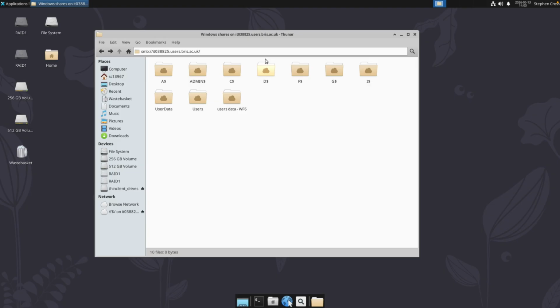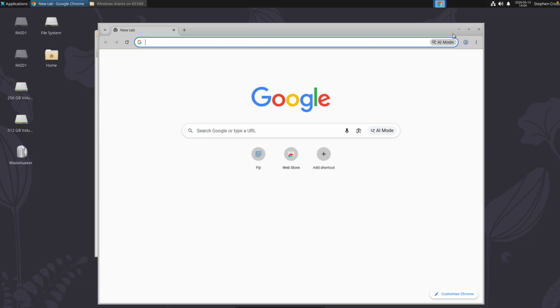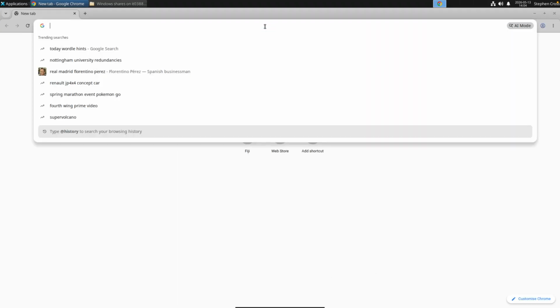As is standard, there is no OneDrive on the computers. That's not just a Linux thing. You'll find the same is true of our new Windows-based image analysis software. If you want to get to OneDrive, you're going to have to do it through the web browser. There is a shortcut already here for the web browser, so you just click that. It's just a reskinned or re-icon version of Google Chrome, so it should be familiar, and then you can access OneDrive from there.